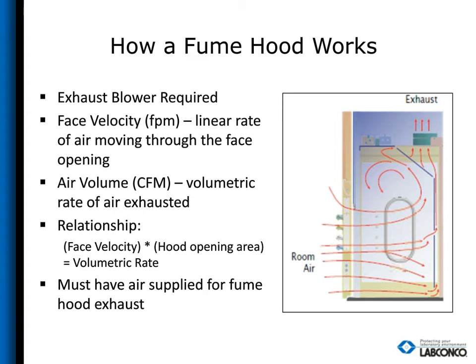You'll hear CFM whenever you talk about HVAC or air movement. It's just saying that we're taking a cubic foot of space and we're filling it with air and seeing how many of those move in a minute. Because remember, just because you can't see the air, you can have too much in a room, you can have too little, or if it's balanced, you can have just the right amount. A room can be starved of air, and then your hood won't be able to contain. This is very important because when you have a fume hood, you need to put makeup air into the room so that it can pull that air out and stay balanced.